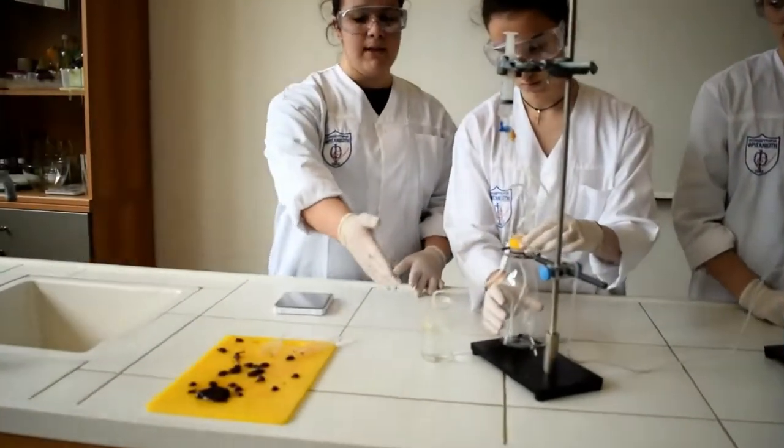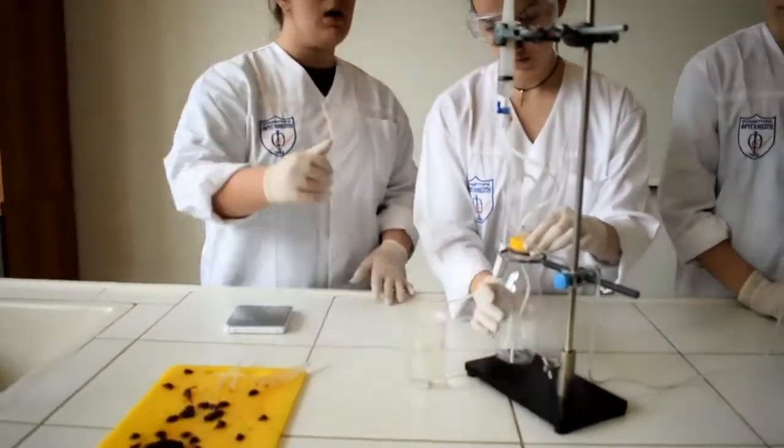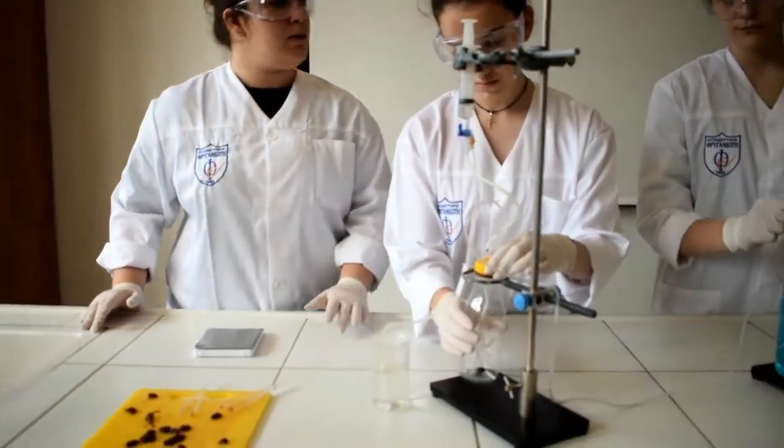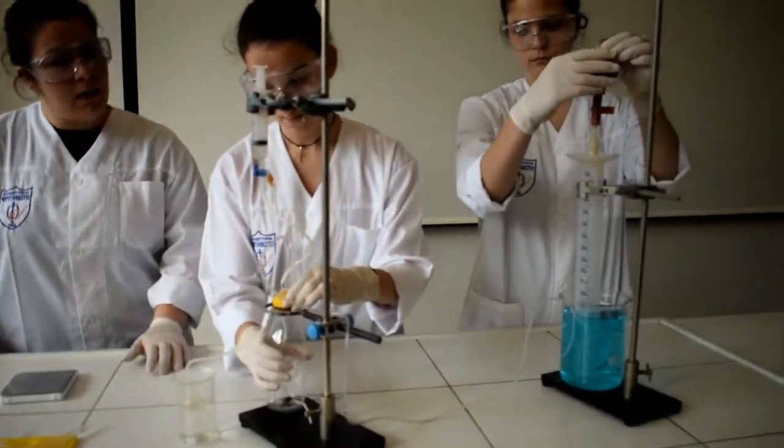100 milliliters of Peridrol are placed in the beaker. We use the bulb to fill the volumetric cylinder with colored water.